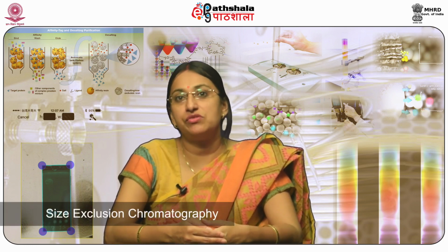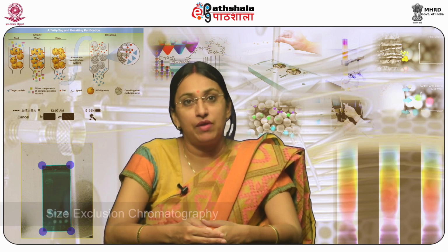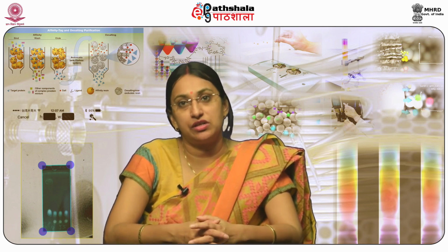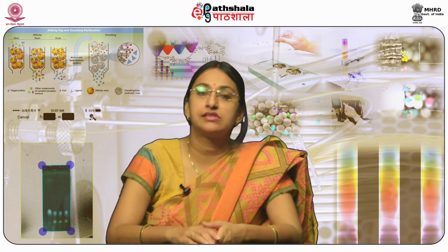For size exclusion chromatography, the mobile phase is selected on the basis of its potential to dissolve the components of the sample and maintain a consistent viscosity at operating temperature. Ionic strength of the solvent is maintained by addition of salts. Highly polar solvents such as water, alcohol, acetone, etc. are not used with polystyrene column packings.